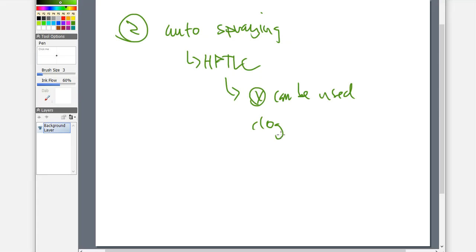And there's nothing worse than getting to the very end here, having a plate that I feel really, really good about, putting it on the sprayer, and then the sprayer basically does that number, and then that reagent drips, that reagent does not get applied uniformly, that reagent is going to make a mess out of my plate, which means that I can't then develop it, and now I'm going to have to do the whole thing all over again. That is very, very aggravating, and that's the major drawback with the auto sprayers. So not universal, not appropriate for everything.